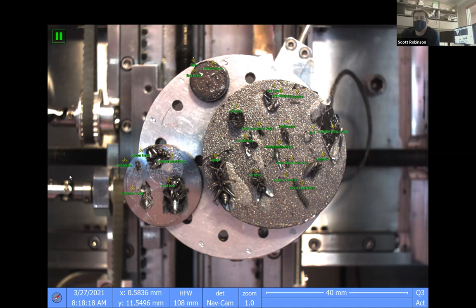And so if you go to bugscope.beckman.illinois.edu, you can see that we have archived images and the typing that we used to use. Kids would ask us questions typing into Bugscope, and then we would answer them. So it wasn't speaking, it was having people type their questions and having us type their answers. And then people would be interested in what they were looking at.